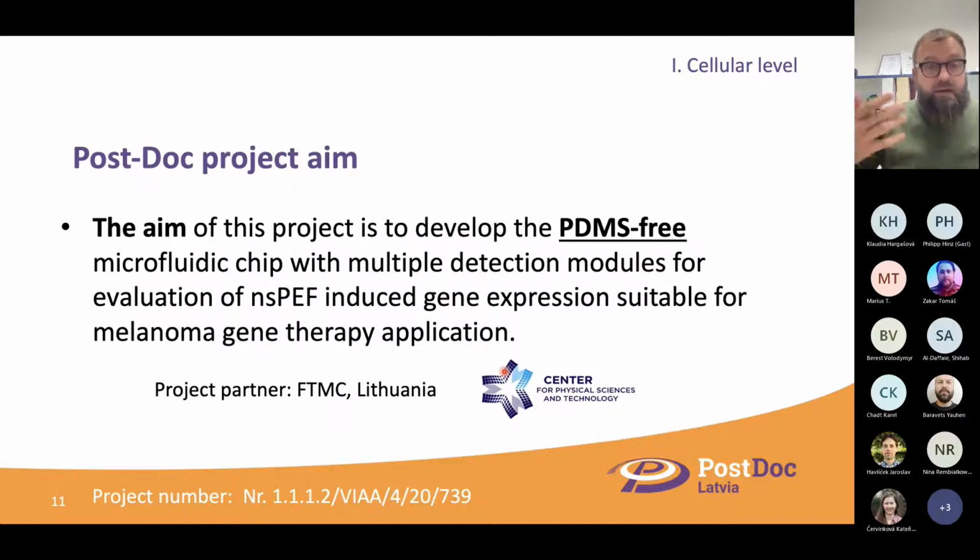So this is the reason why I started my postdoc project. In this project, I really want to develop a PDMS-free microfluidic chip, which can be suitable for detection and evaluation of nanosecond electrical field treatment, and that kind of treatment would be great to explore as a precise gene expression inducing signal.